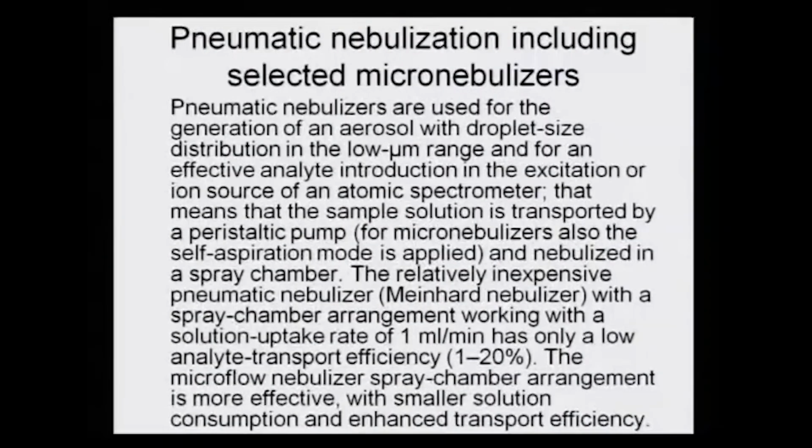The microflow nebulizer spray chamber arrangement is more effective with smaller solution consumption and enhanced transport efficiency. So, what is the advantage? With these microflow nebulizers, not too much solution is coming. As a result, the aerosol forms efficiently with a smaller droplet size, and the droplets are sufficiently large in number to be analyzed properly.